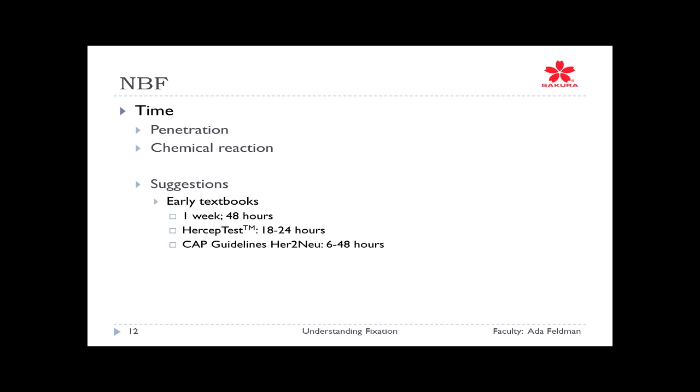The breast tissue, if you are going to use that test as part of the diagnostic tool, those breast biopsies and breast tissues are supposed to be fixed for 18 to 24 hours. The CAP guidelines for HER2/neu are saying 6 to 48 hours, all right? But depending upon what company's Herceptin test you're using, the 18 to 24 hours was the DAKO. Now that can vary with the manufacturer.